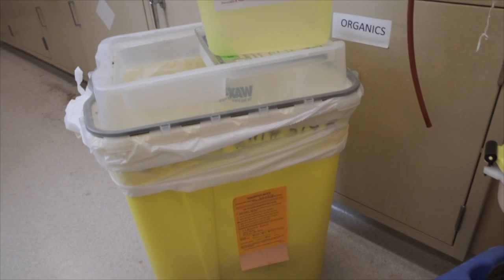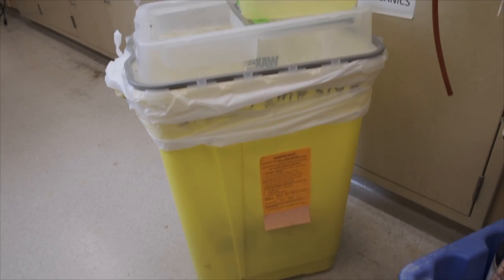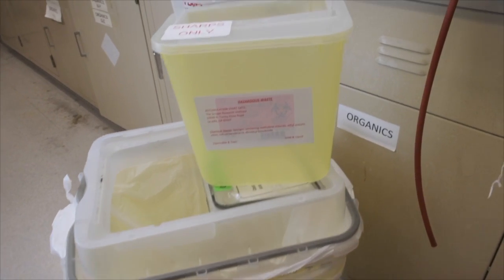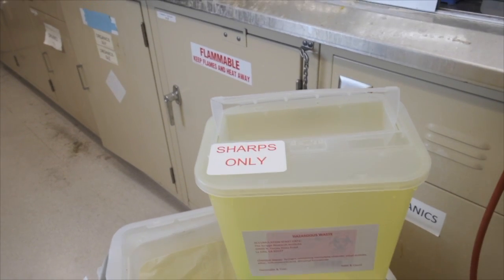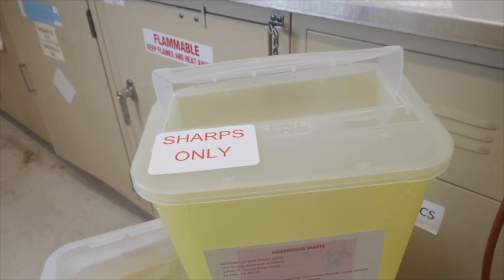This yellow debris bin is for chemical contaminated laboratory debris. If you have chemical contaminated sharps waste, such as razor blades, needles, or syringes, they would go in a yellow sharps container with a hazardous waste label.